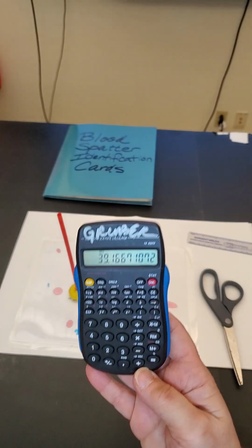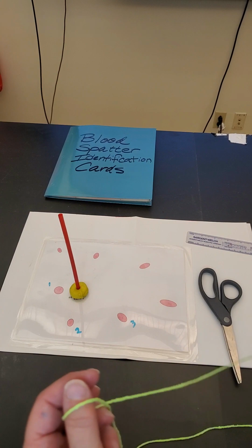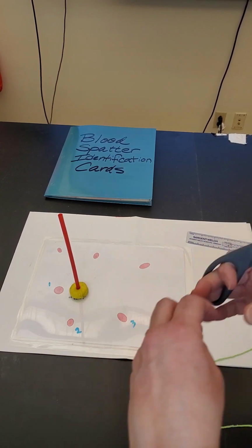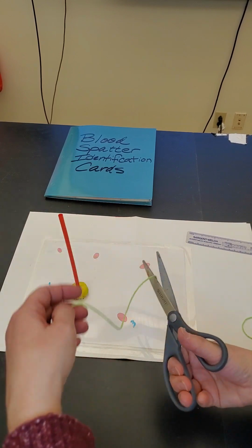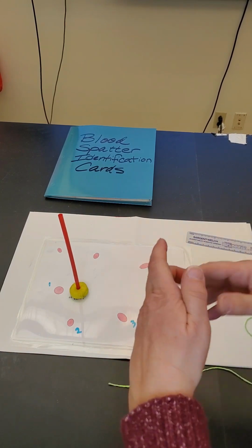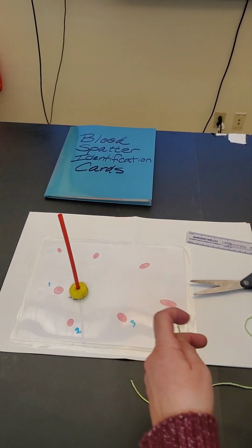So I'm going to take a piece of string, okay, cut up the string. You don't want to make it super long because you don't want too much waste. So maybe this would be fine. All right, here's my string. I'm going to take the string.